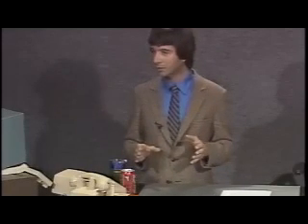I'm going to give you the punchline first. The resolution is not like the resolution of a field ion microscope image. It's about 20 angstroms. So not too many people are interested yet. But the hope is to increase the resolution. And why is that of interest? It's of interest because we don't have to shadow or stain or selectively change the contour of a molecule to enhance its contrast, as you have to do in the electron microscope.